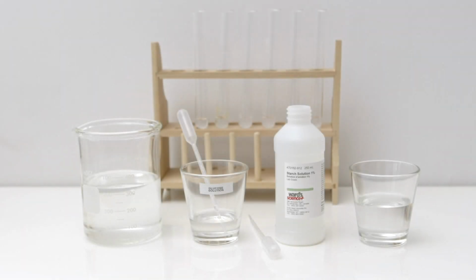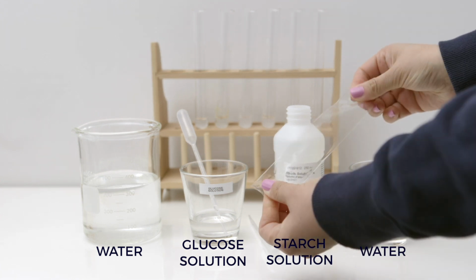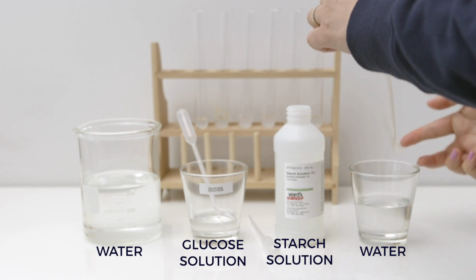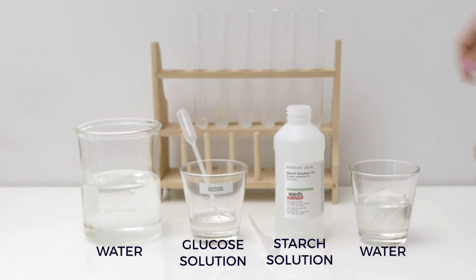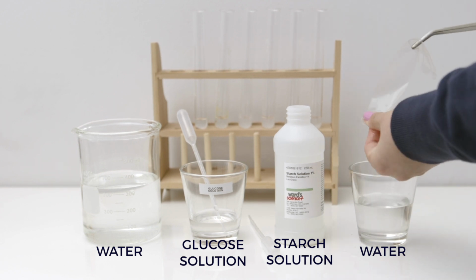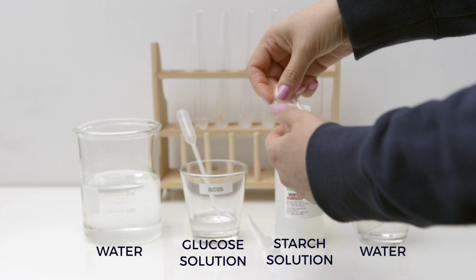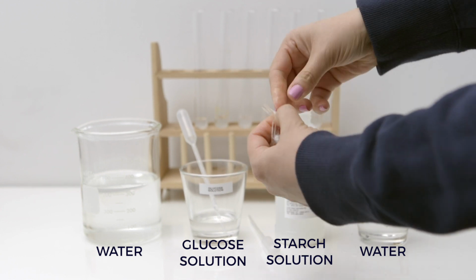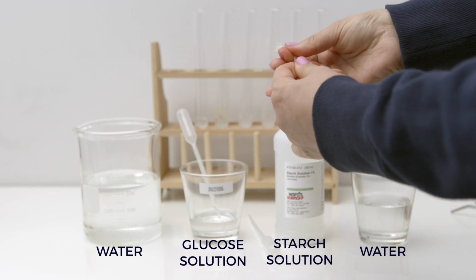We begin with a large beaker of water, a glucose solution, a starch solution, a cup of water, and a 6-inch strip of the dialysis tubing. First, briefly soak the dialysis tubing in the cup of water to open the ends. Tie off one open end and dip it again if needed to open the other end.